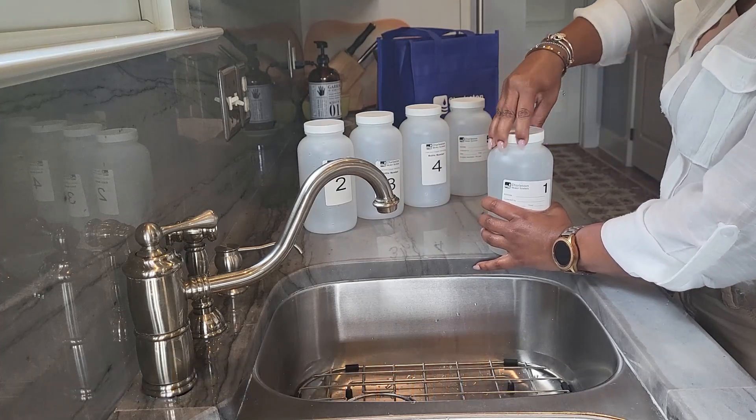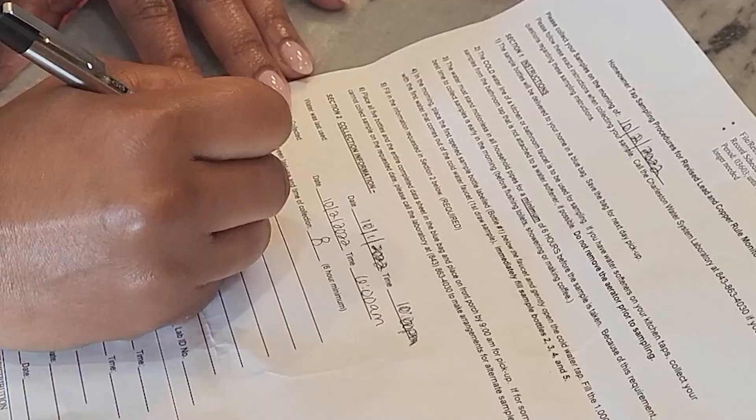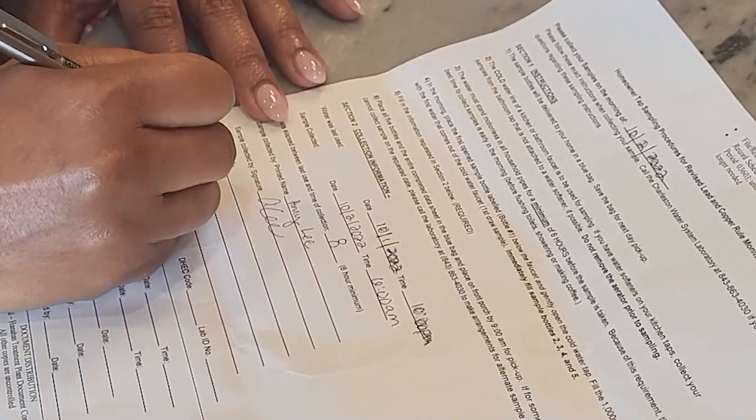Continue filling up the remaining four bottles in succession. Once filled, make sure to secure the caps on all five bottles. Next, complete and sign the paperwork included in your sample kit, and be sure to fill out the six-hour mark.